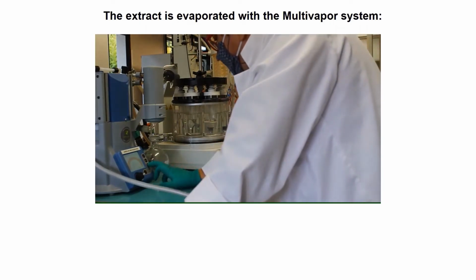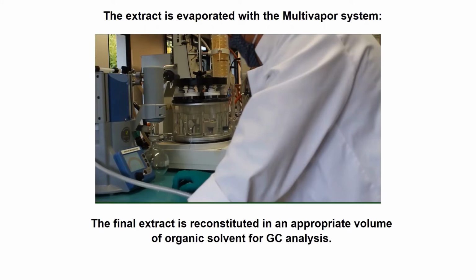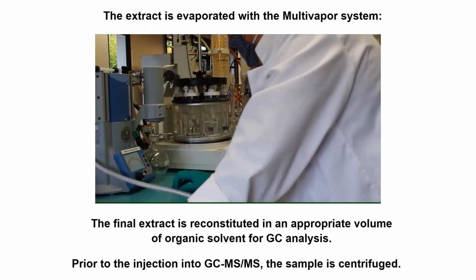Then, the final extract is resuspended in an appropriate volume of organic solvent for GC analysis, and prior to the injection into GC-MS-MS, the sample is centrifuged.